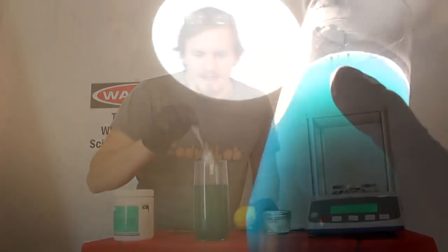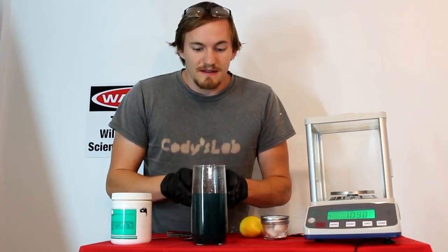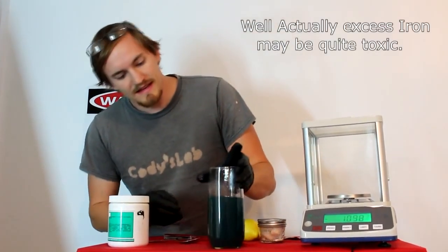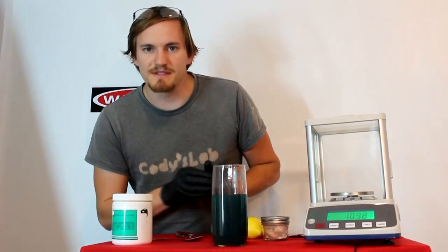As you can see, the solution has turned a nice bright blue color as the ferric ferrocyanide is being precipitated from the solution. That coloring actually means that the cyanide has been completely destroyed and is now completely safe and non-toxic. In fact, that coloring was once used in blueprints for the blue ink.